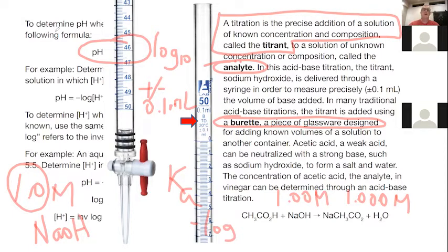Anyone remember when we talked about our experiment last week, when we had something with TC and TD on top of the piece of glassware? Do you remember what the TC and the TD stood for? Remember, we were using all kinds of different glassware to measure the volumes of things. And at the top of the piece of glassware, it either said TD, it said TC/TD for most of them. For some, it just had TC. Nobody remembers.